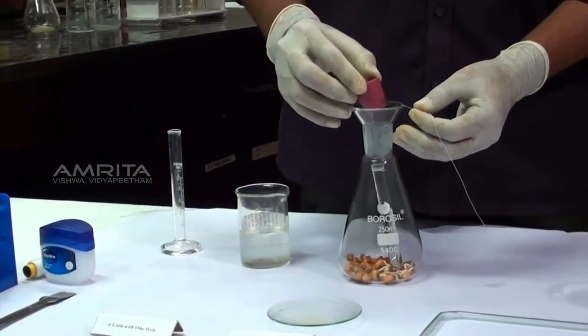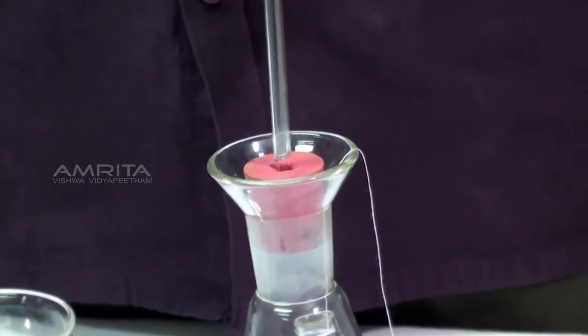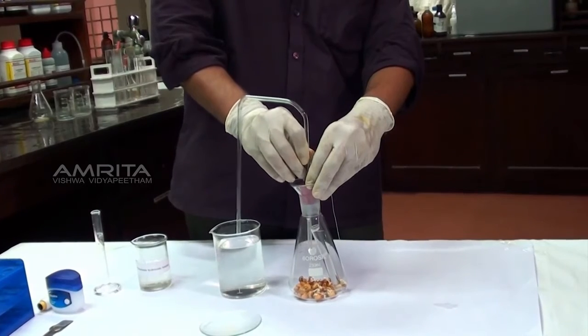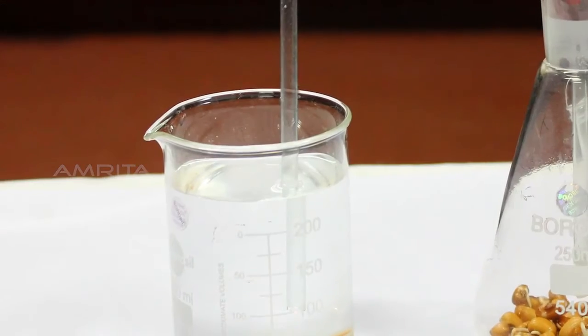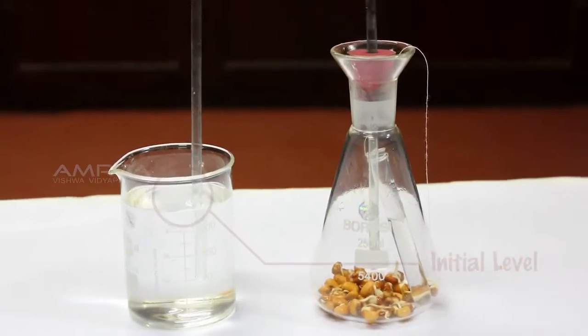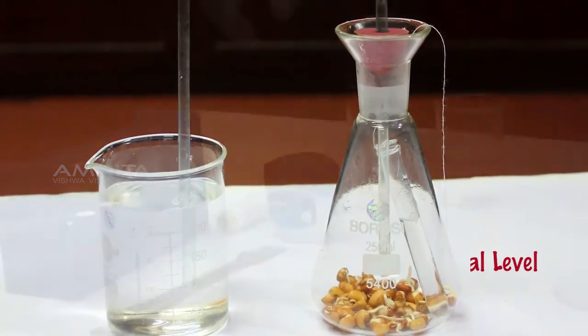Close the mouth of the conical flask with a cork. Insert one end of a delivery tube into the conical flask through the cork and dip the other in a beaker containing water. Observe the position of the water level in the delivery tube. This is the initial reading of the water level in the delivery tube.